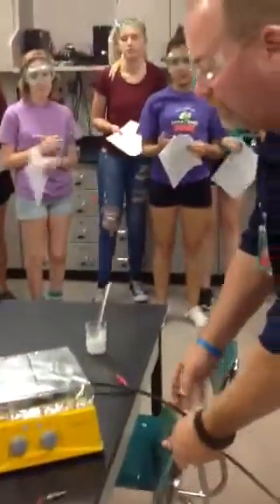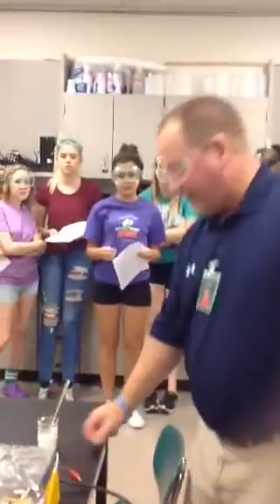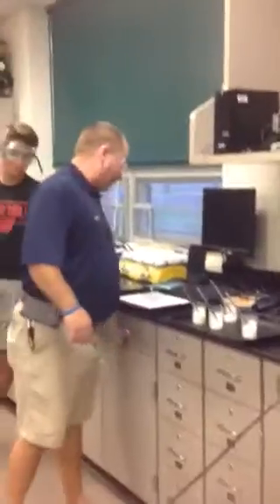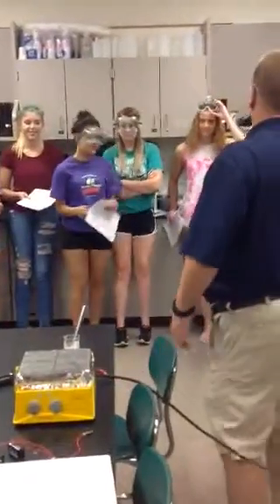What we're going to do is, I've taken a hot plate, because they wanted us to do it with a candle and a flame and yada yada. And I said, I don't think that's what we're going to do. So I've taken a hot plate and I put aluminum foil on top of it.